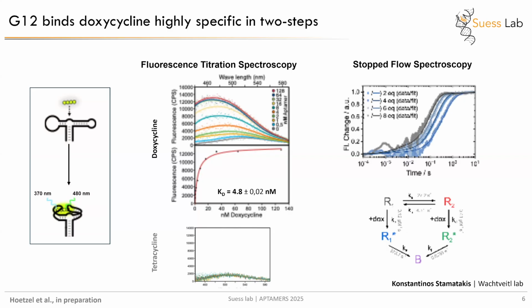We talked about it. What you should see here from blue to gray is experimental data of the binding. So we resolve here the binding over time. We have the fluorescence signal on the y-axis and the time on the x-axis.